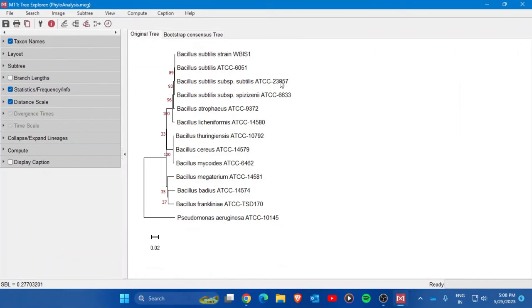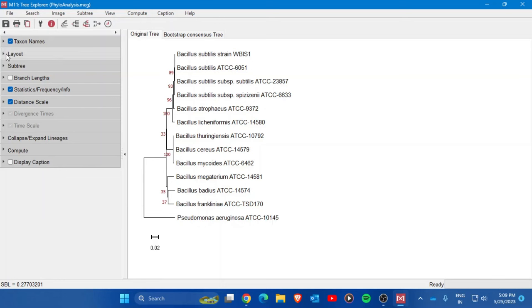The phylogenetic tree is now displayed. You can see the Bacillus subtilis strain — that's my isolate's sequence — and it is clustering together with the Bacillus subtilis ATCC strain 6051, forming the same clade or cluster. At the bottom, Pseudomonas aeruginosa appears as the outgroup, which is exactly what was intended.